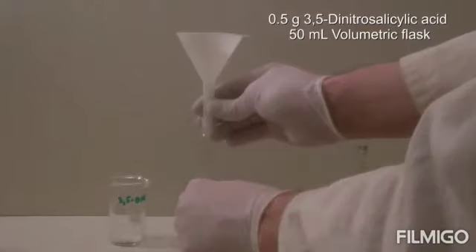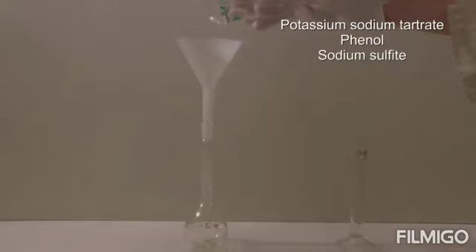These are the apparatus required for the quantitative analysis of reducing sugar. Here, take 0.5 gram of 3,5-dinitrosalicylic acid in 50 ml of volumetric flask. Then add into it potassium sodium tartarate, phenol and sodium sulfite. These are useful to stabilize the DNSA reagent.